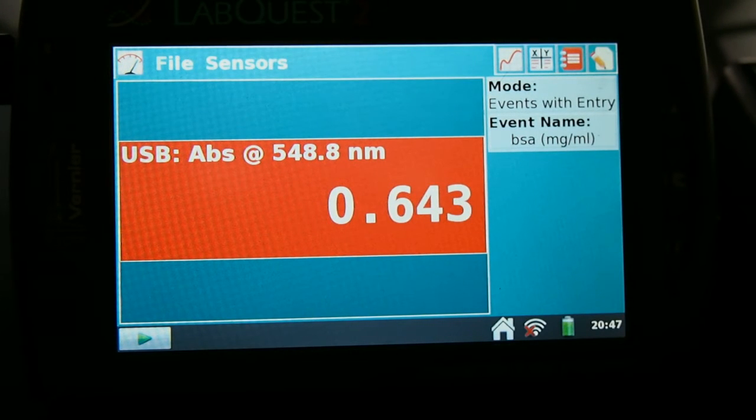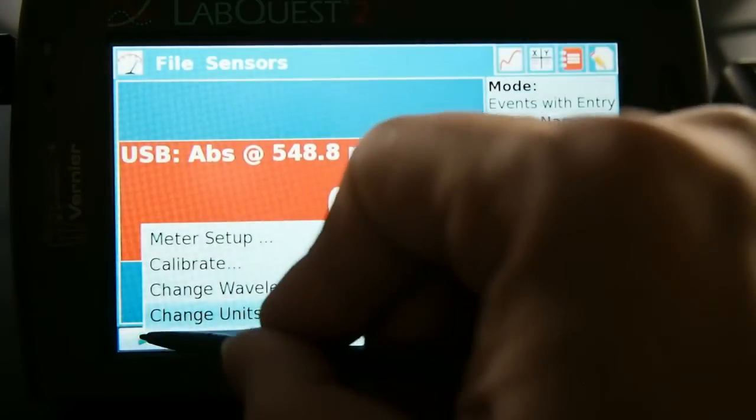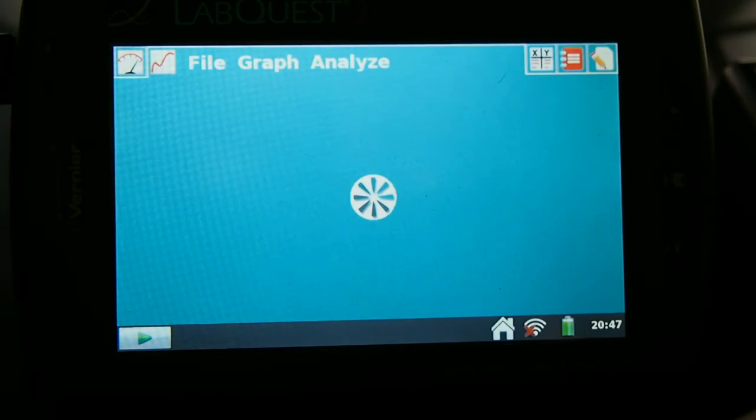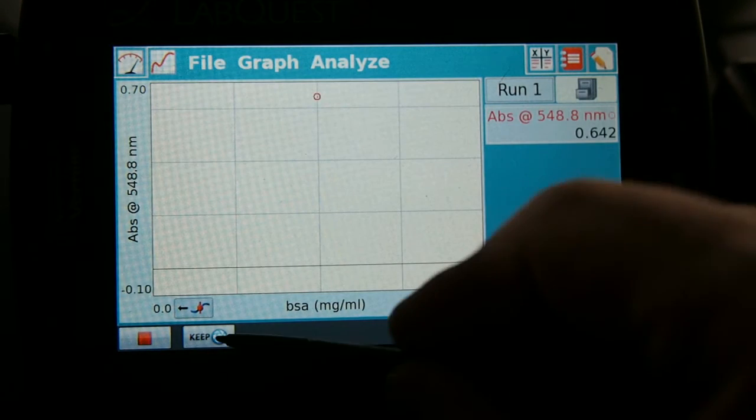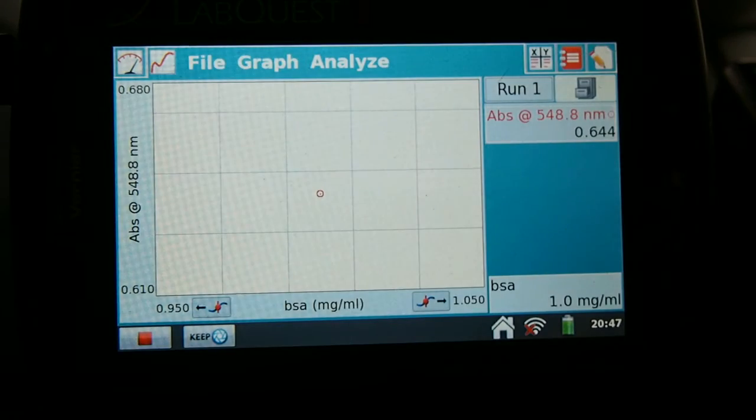So now it's not exactly 540 nm, but it's close enough, and you can see the highest concentration is about 0.64 absorbance. We can press the play button to stop it, and you can see the point is saved. We can press keep, and we can indicate what the actual concentration is, which is 1.